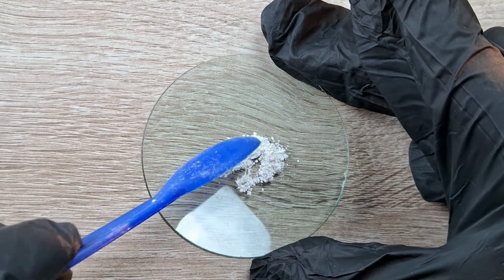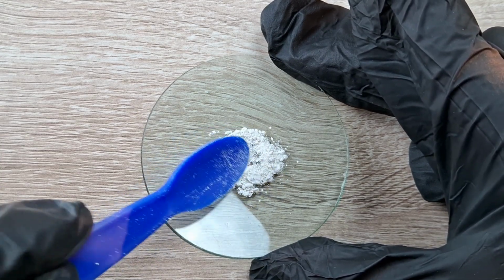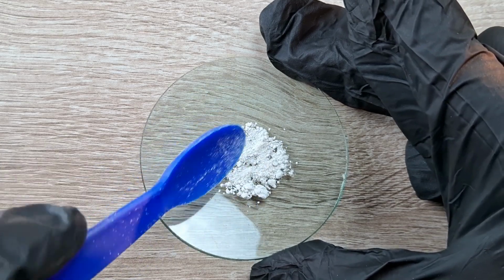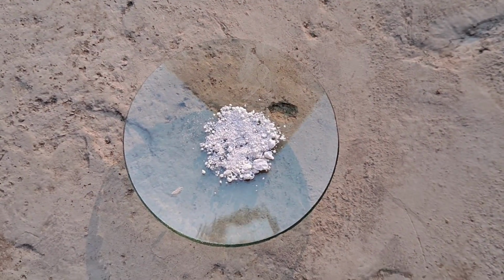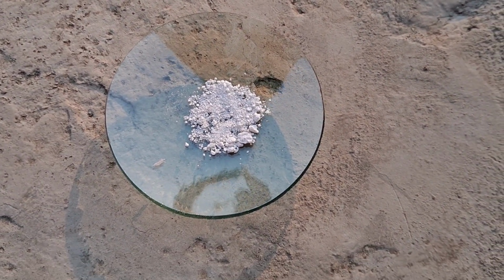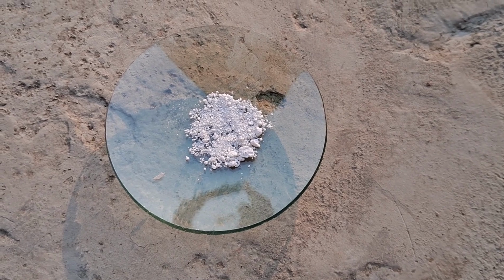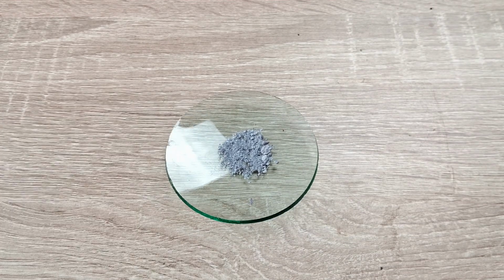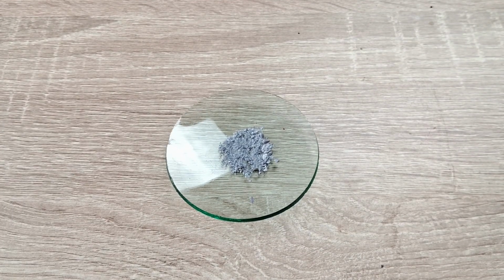Note that the color of pure silver chloride is white. Now, leave the watch glass in sunlight for several minutes and observe what happens. After exposure to sunlight, the white silver chloride gradually turns dark gray in color.